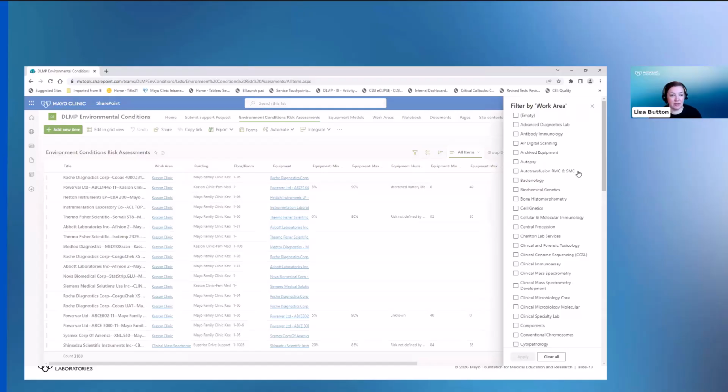benefits of using SharePoint is that you, as a quality or technical supervisor, are likely only responsible for one lab, or maybe one lab that has 2 or 3 physical locations. So you could set a custom view so you're really only seeing your items when you come in here. In my use case for this, I am interested in seeing everyone. So for today, we'll show you what bacteriology looks like.